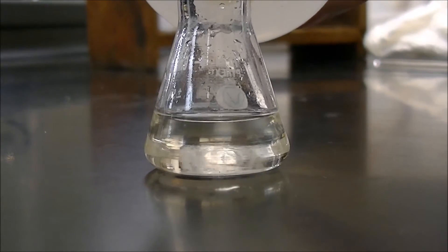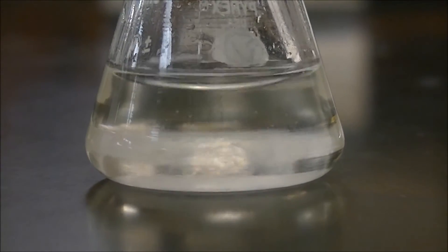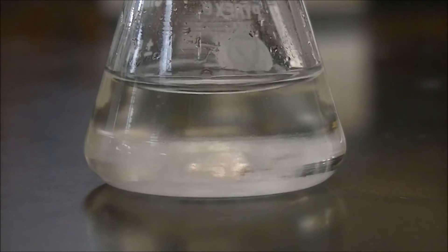Here you can see that ethyl-4-aminobenzoate is precipitating out of solution. To get all the product we can, we will add base until the pH is basic.